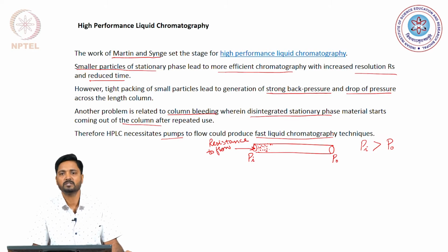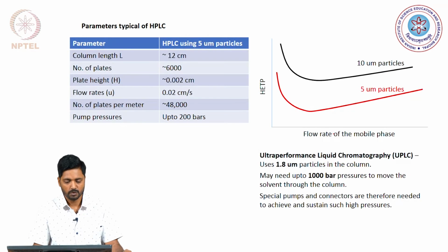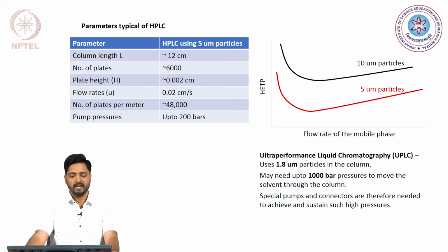Based on the particle size that is being used in the chromatography column, the pump performance has to be carefully chosen.